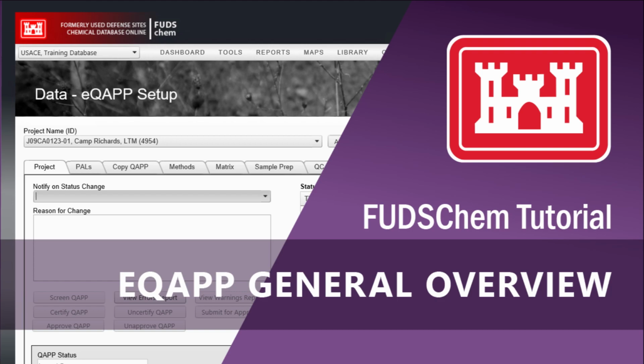This video will give a brief overview of how to create electronic QAPPs, eQAPPs, in FUDSChem. The eQAPP Setup tool allows you to create an electronic version of the UFP QAPP. It is used to ensure that all methods and analyte lists in the electronic COCs, ChemField files, and lab data are consistent with project requirements. The eQAPP also determines how the Automated Data Review, ADR, process will apply certain qualifiers to sample results.